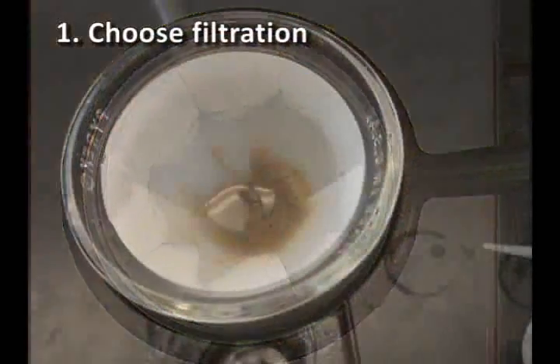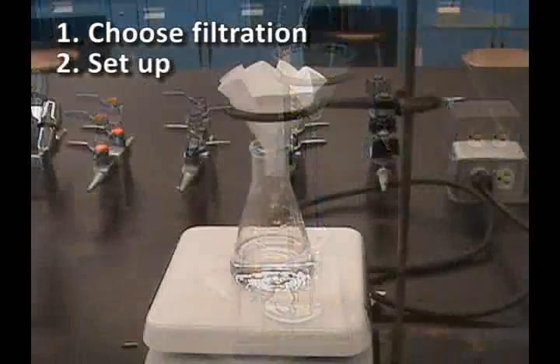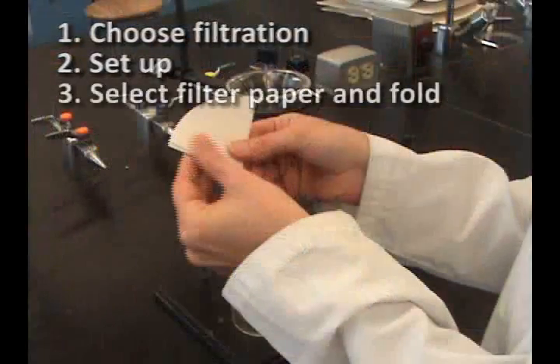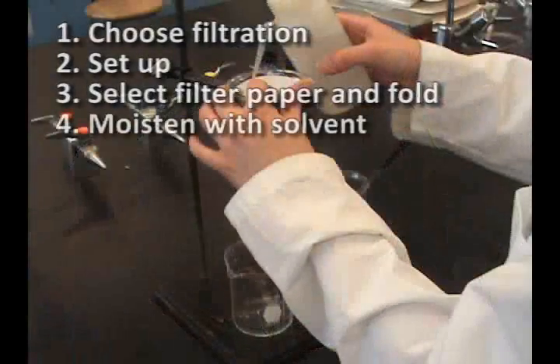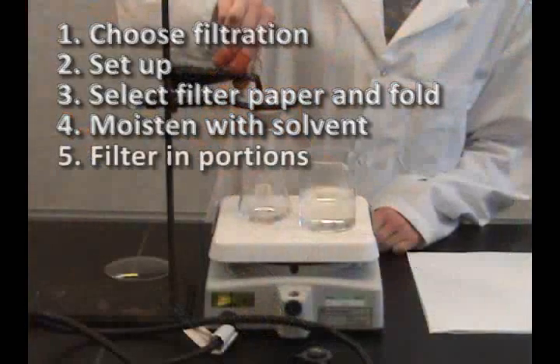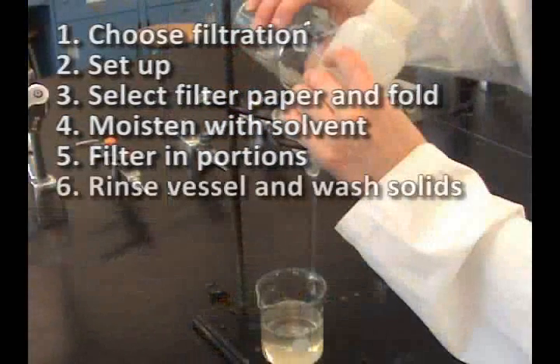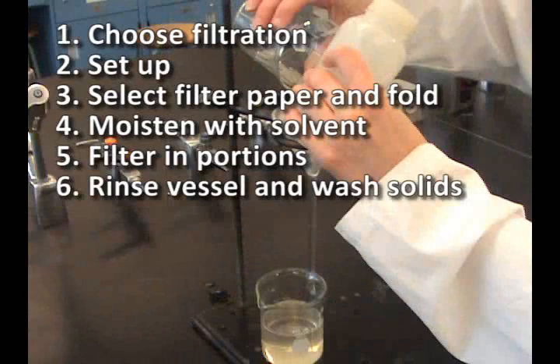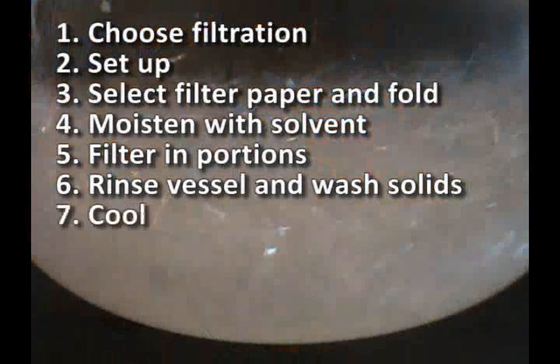Let's review the steps. Choose the type of filtration, either hot or cold. Set up apparatus for chosen filtration. Select the correct filter paper and fold accordingly. Moisten the paper with hot or cold solvent. Filter solution in portions. Rinse the transfer vessel to ensure all solid is filtered and then wash the solids. If hot filtering, allow solution to cool for crystals to form. Now you are ready to filter.